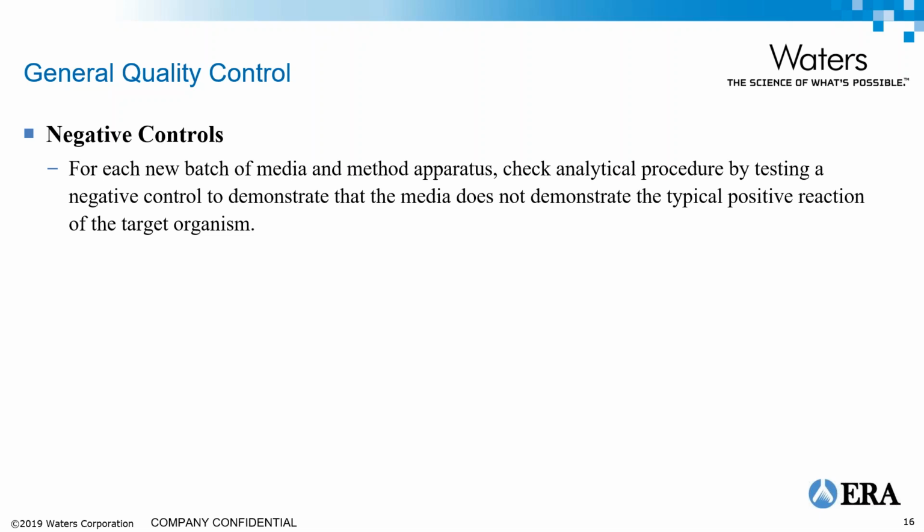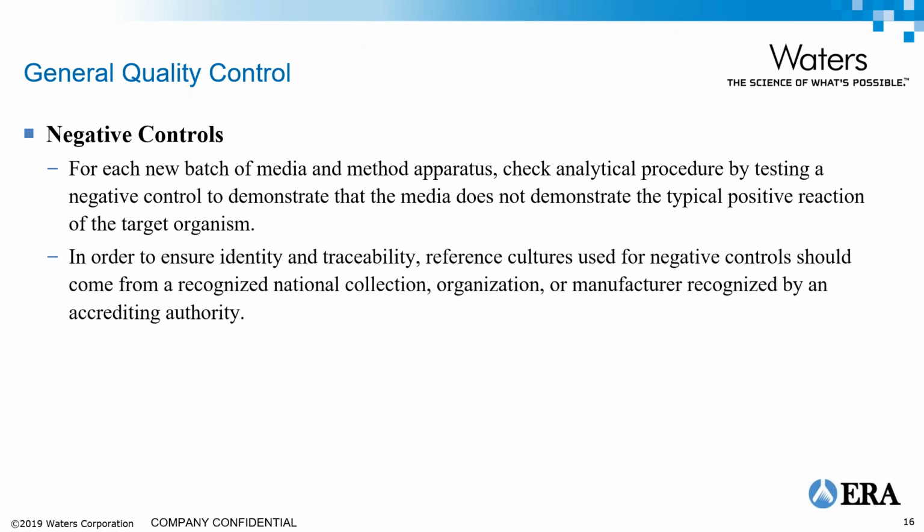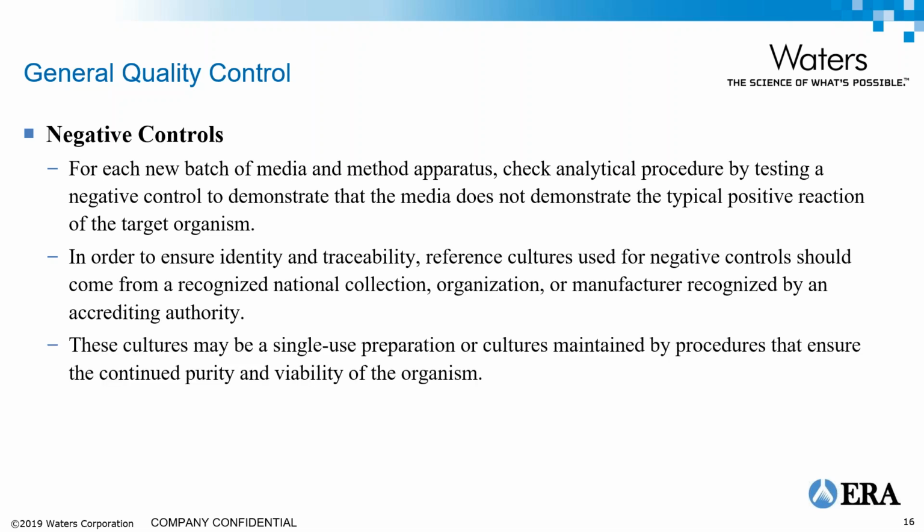So, and again, for this, you want to ensure the identity and traceability of the reference culture that you're using. Either get it from a recognized national collection or organization or a manufacturer that's recognized by an accrediting authority. And again, they can be single use or they can be cultures that you're maintaining.